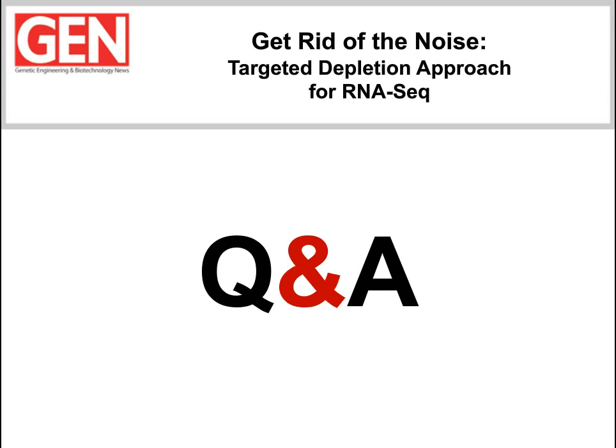In terms of deviations from standard parameters, we do have a custom read one primer that comes with the kit. That can be used if you are sequencing Solo libraries alone. However, if you want to pool these Solo libraries in a sequencing lane with non-Solo libraries, that can also be done. For that, we recommend pooling Solo libraries to no more than 60% of the total input. And in that case, sequencing can be done using the standard Illumina read one primer.